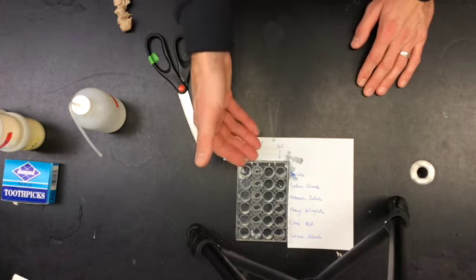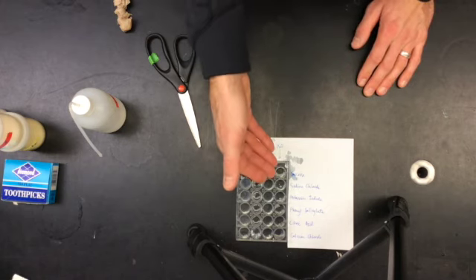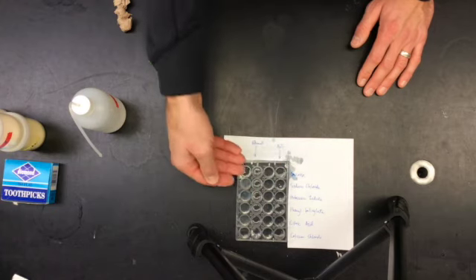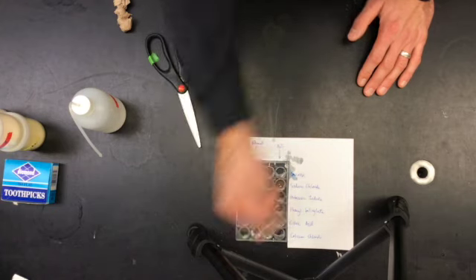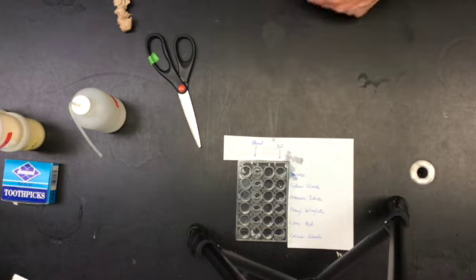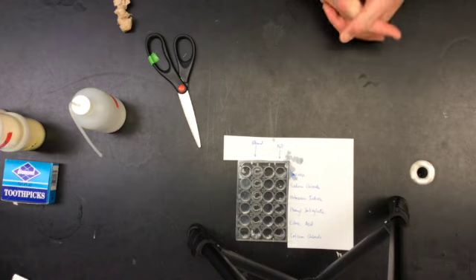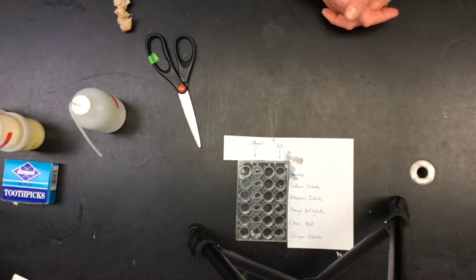You need to make that distinction for these 6 compounds in water, and then again, these 6 compounds in ethanol. All right, so that's the end of the solubility and conductivity portion of the lab. At this point, you should have all the data that you need to be able to complete your CER statement and answer our 2 analysis questions.